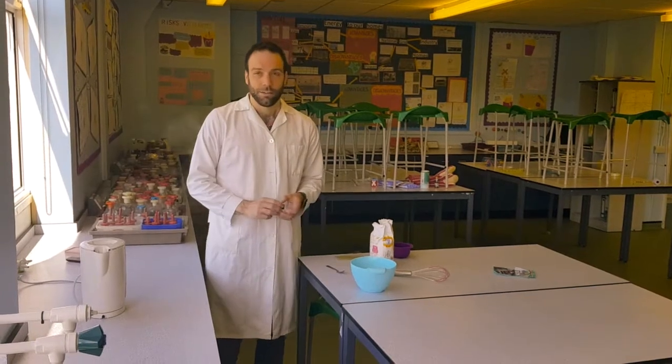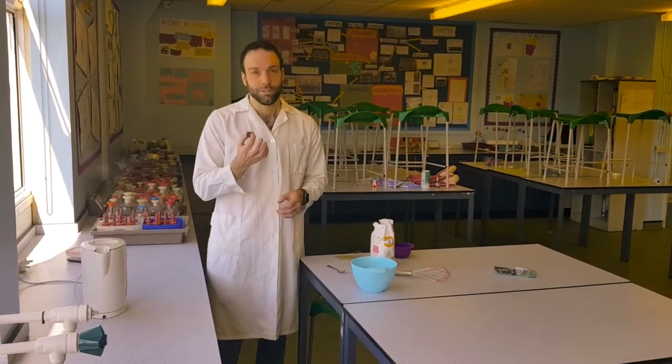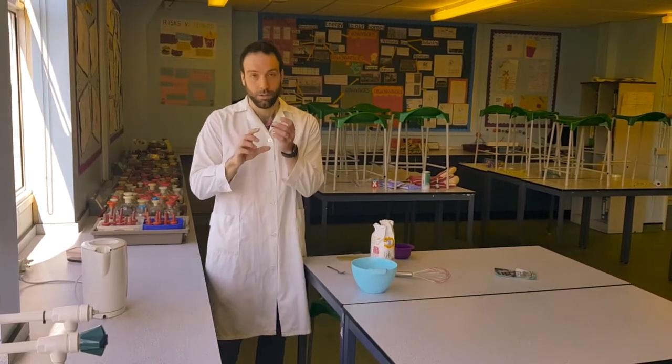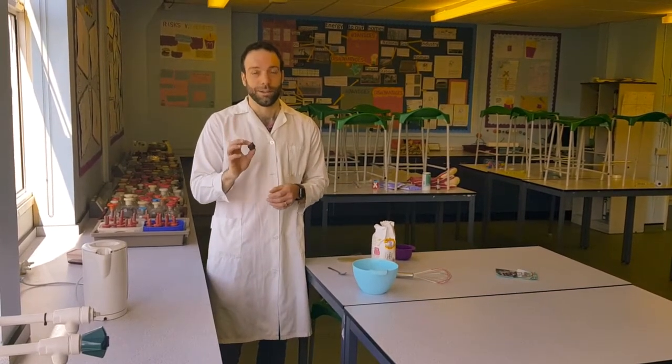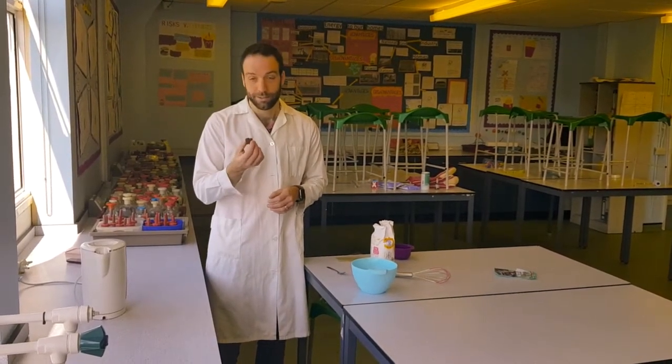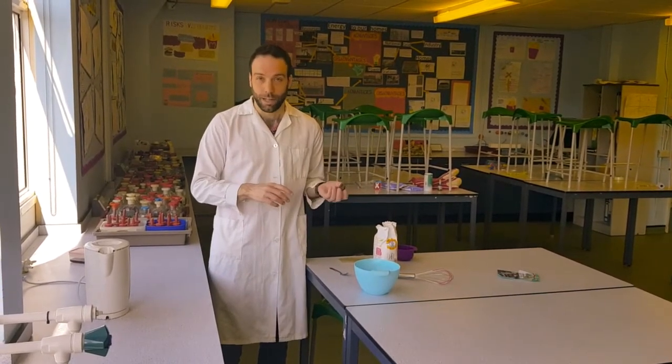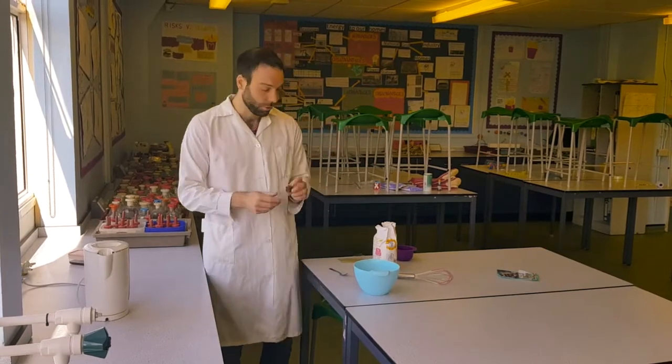The ingredients you're going to need to provide the nutrients that bacteria need to grow: first, one low-salt beef stock cube. It needs to be low salt because bacteria don't like salt — that's why we often put salt on things to stop bacteria from growing. So crumble one stock cube into your bowl.